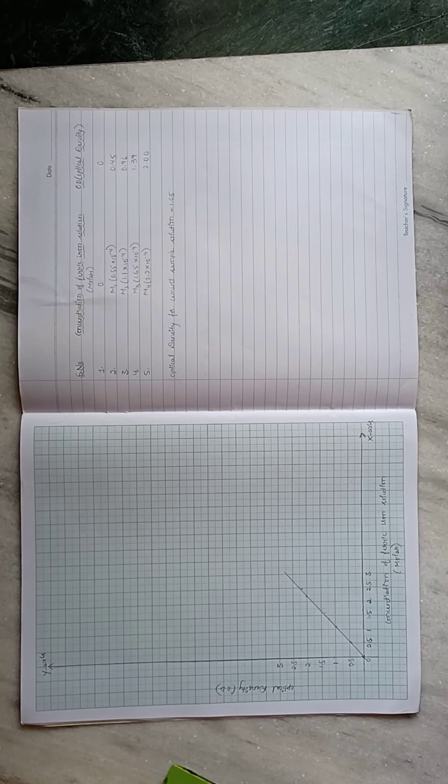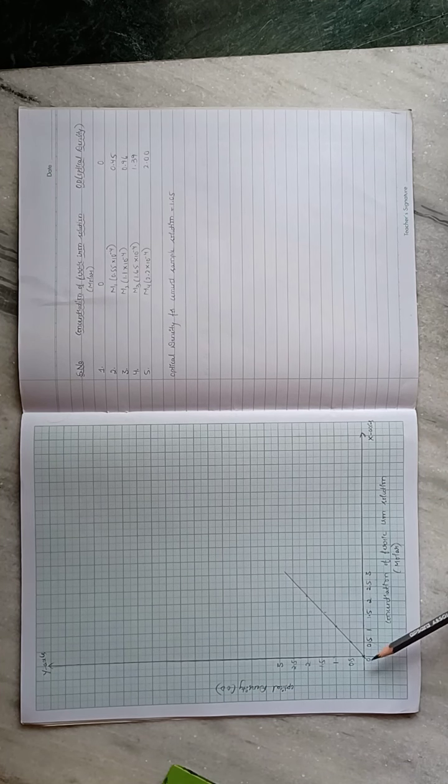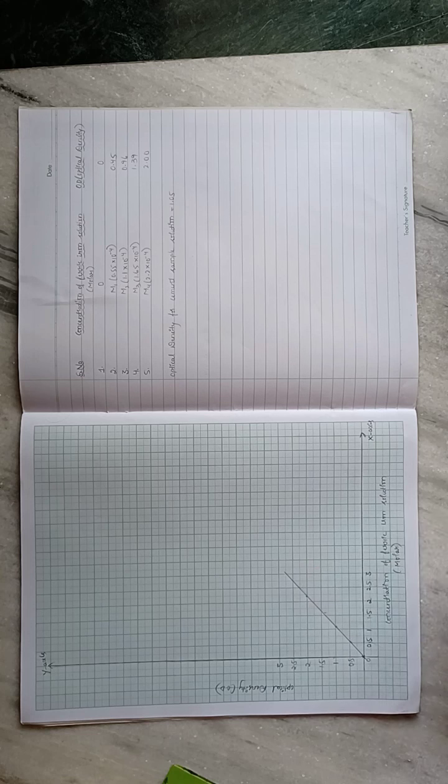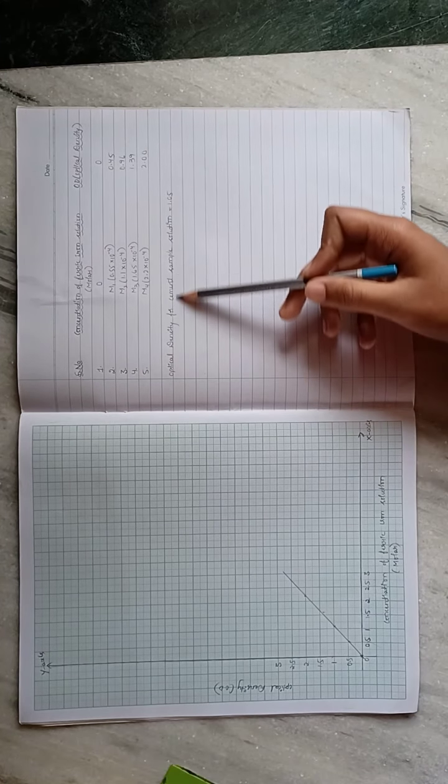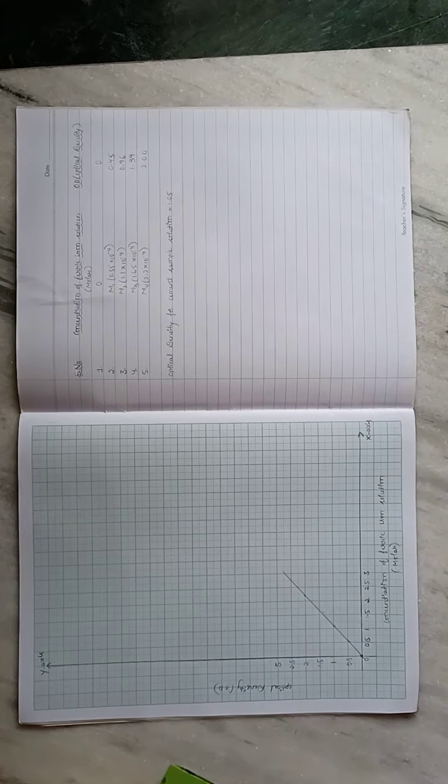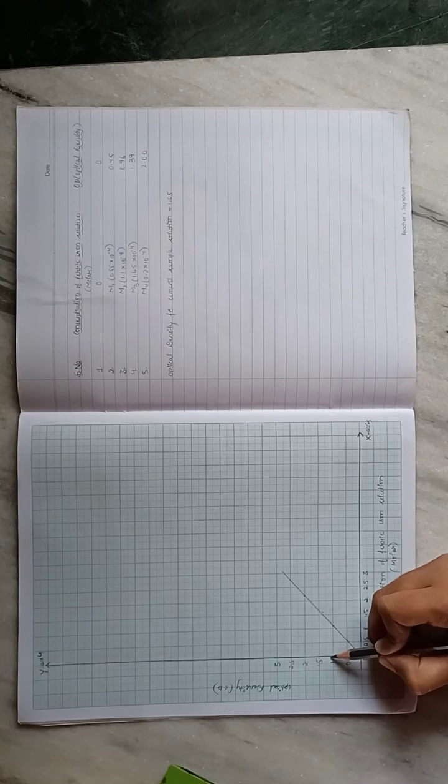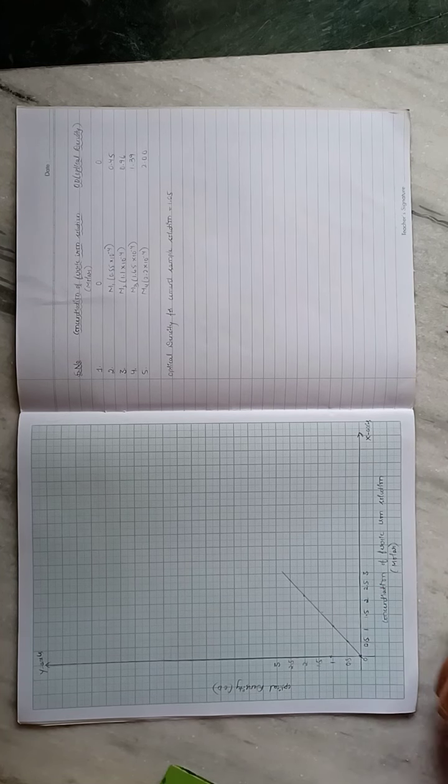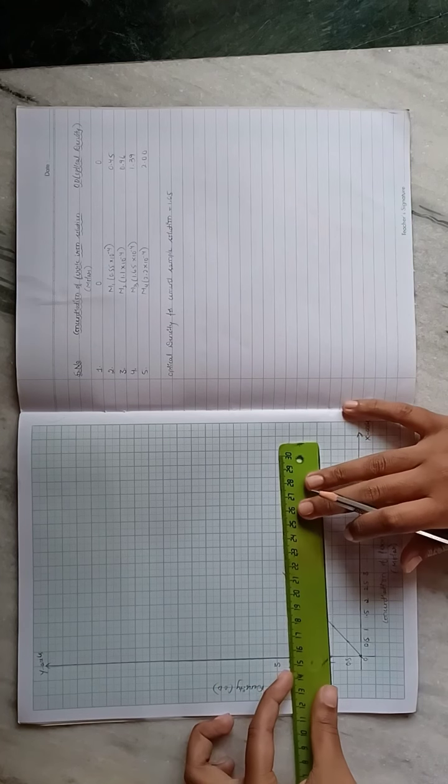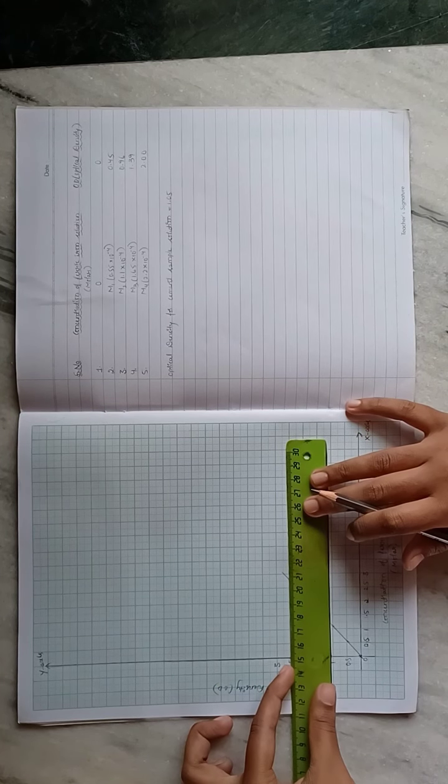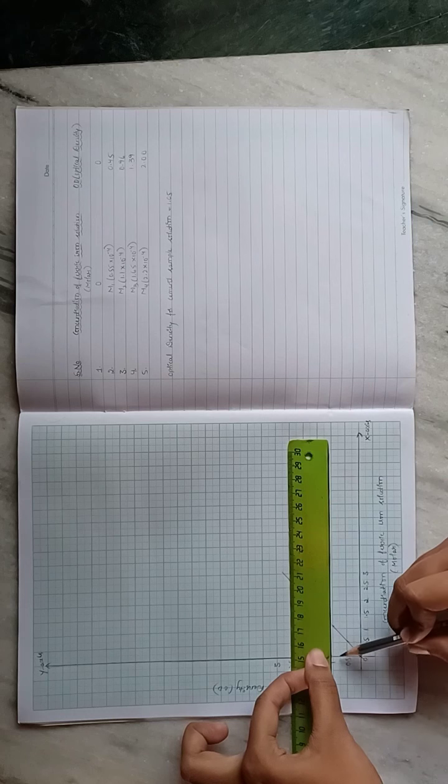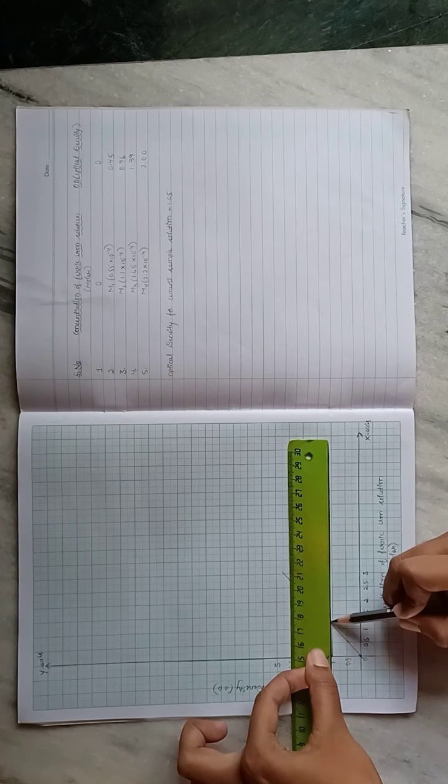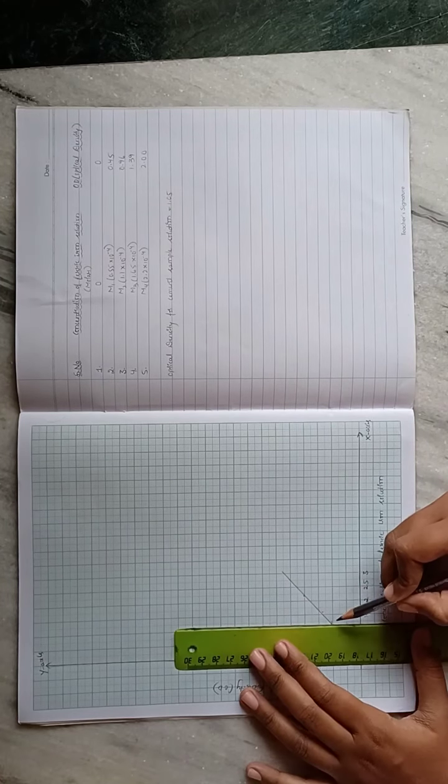Now here, we already got a reading, that is optical density for cement sample solution as 1.05. Mark 1.05 on y-axis, draw a straight line from the point to the straight line we got earlier, and then from that draw a straight line to the x-axis.